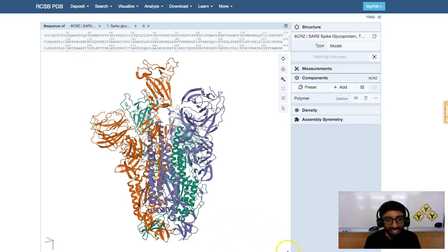But down over here is where you can actually get the specific information. This is aspartic acid 10. This is aspartic acid 11, amino acid number 11. This is amino acid number 12. It's a valine if you look in the lower right. Okay, that's the primary structure of one of these polypeptides.